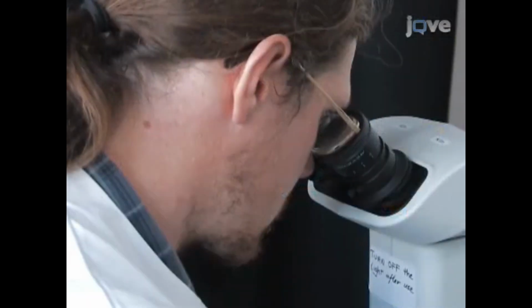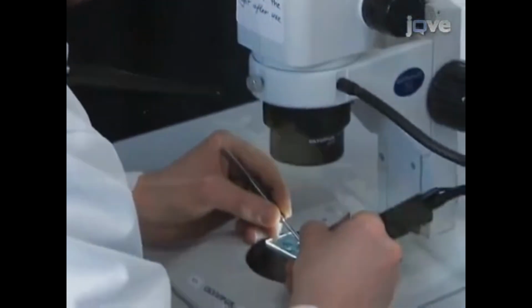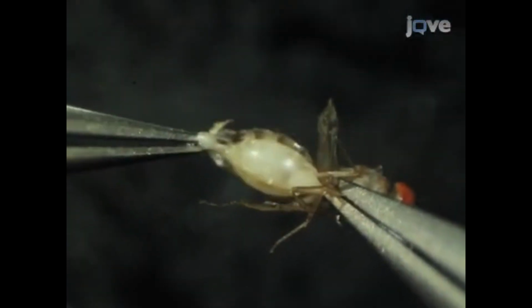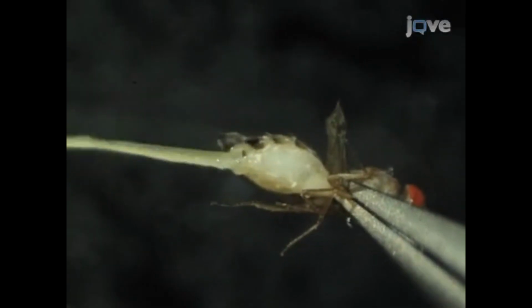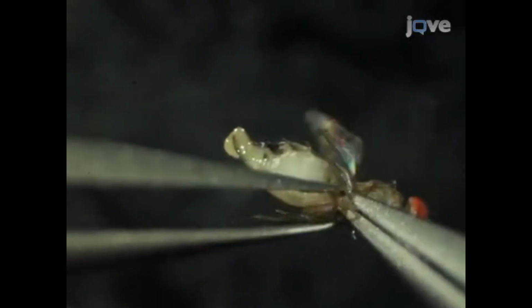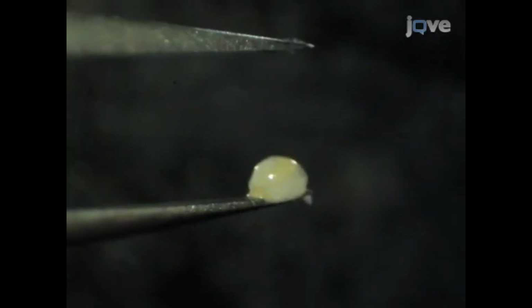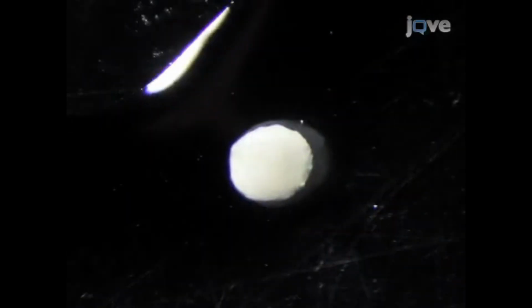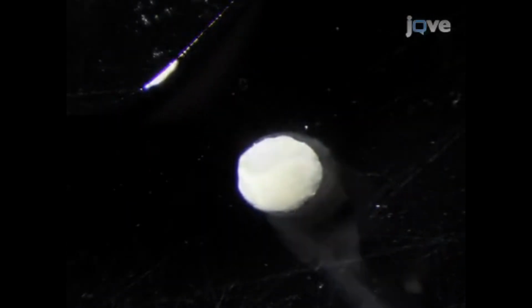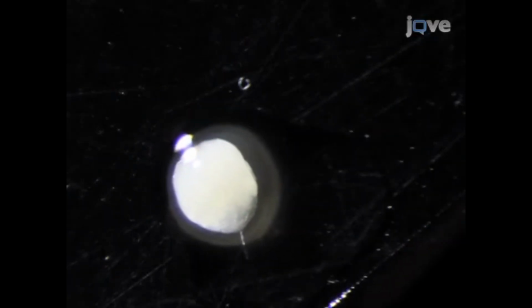Using a second pair of forceps, remove the tissue at the extreme posterior of the female. This will usually include gut tissues. With clean forceps, gently massage the abdomen from the anterior to the posterior end, like squeezing toothpaste from a tube. The ovaries look like large opaque structures and will stick on the end of the forceps. Collect the ovaries by touching them to the halocarbon oil on the slide. Then, repeat the process until 4 to 6 ovaries are collected.